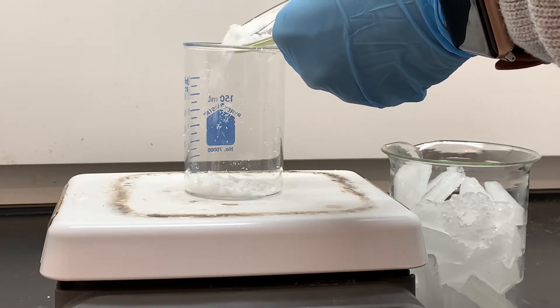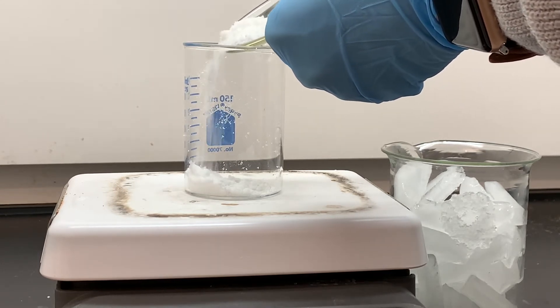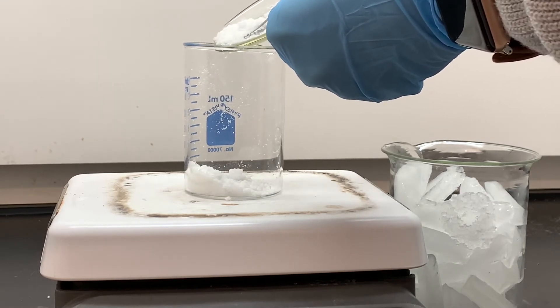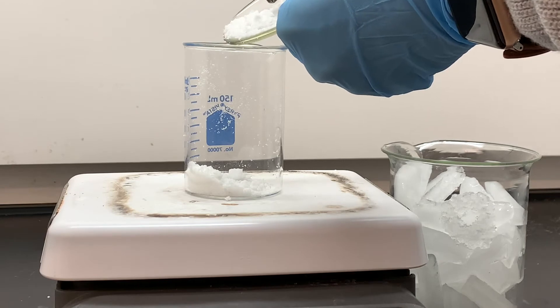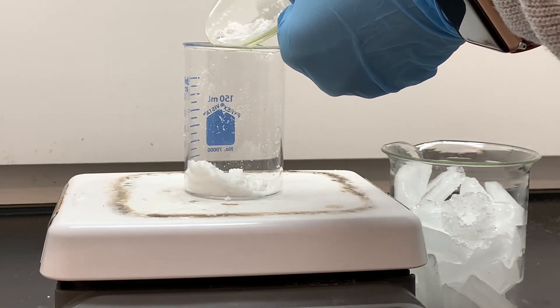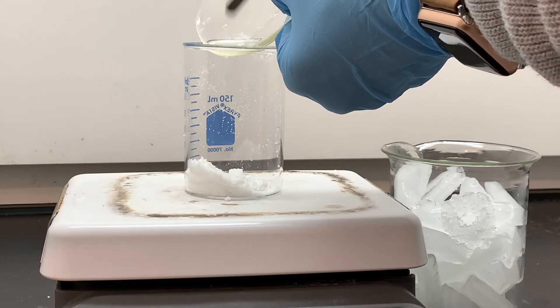We're going to be transferring it into this beaker, and we're going to be heating it very gently on the hot plate. It's really important that we work at a low heat so that we don't char or burn any of this camphor. We just want it to heat up into a gas, sublime.